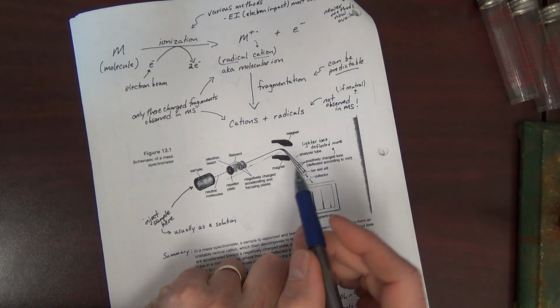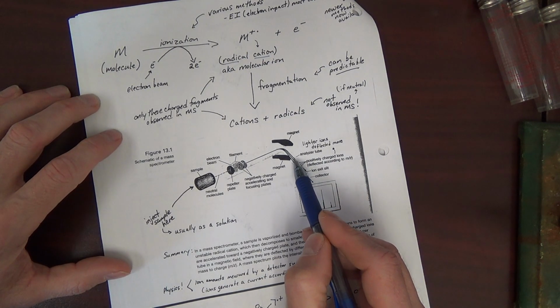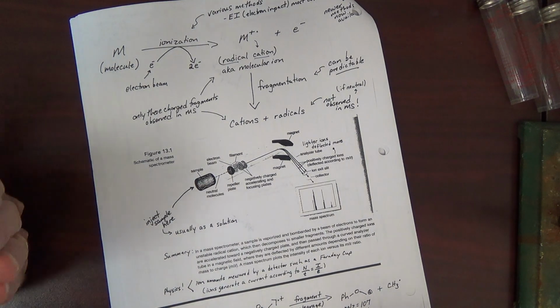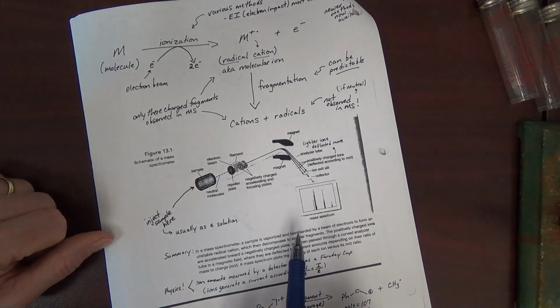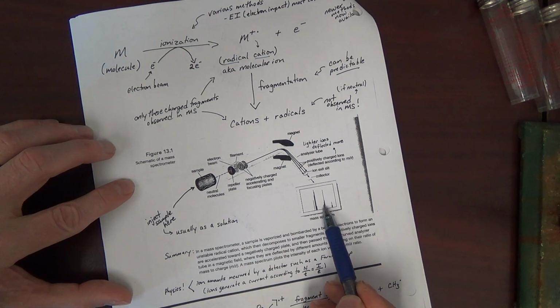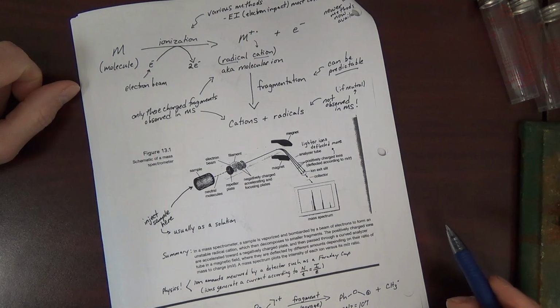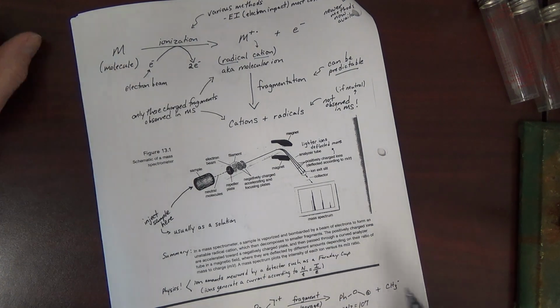Now, one other thing we can say here is the degree of deflection is also based on the charge. Okay? That is, you can have two particles with the same mass, but one that has a charge of twice as much, like a charge of 2 plus, that particle will be deflected twice as much. So two signals could be the same mass, but they would have different charge. Now, it's most common for anything that we're going to be dealing with here at the introductory stage for the charge to only be +1. Since the charge is always +1, we can essentially call each signal the mass.